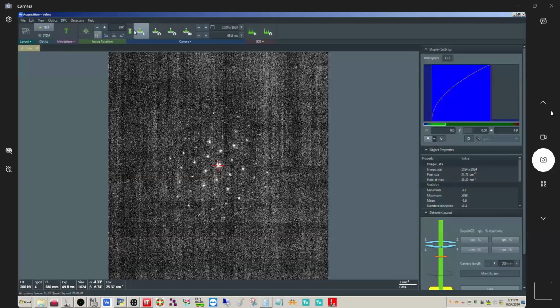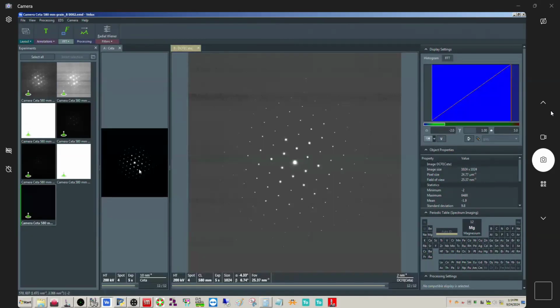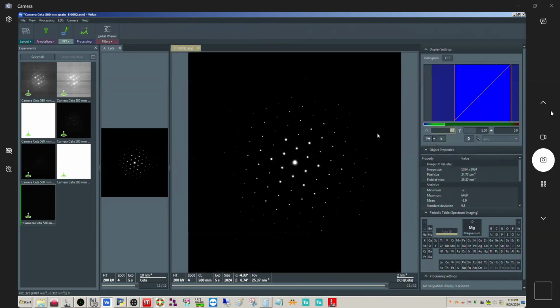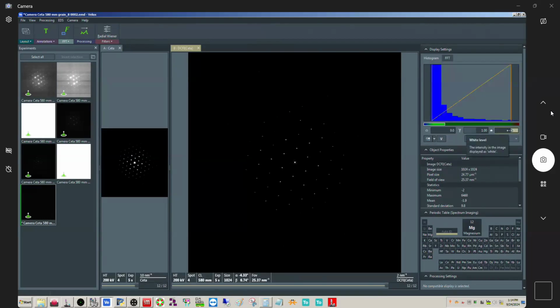All right, let me stop this, blank the beam. Okay, so now this is 0 and 3. So we can type in, yeah, so I would always do that. If it's doing negative counts, put this at 0. And then we can fudge the max here more. So, all right, that's maybe a little much. But you can see now we're getting more here in terms of the histogram.